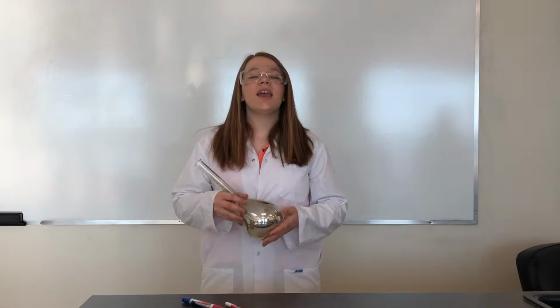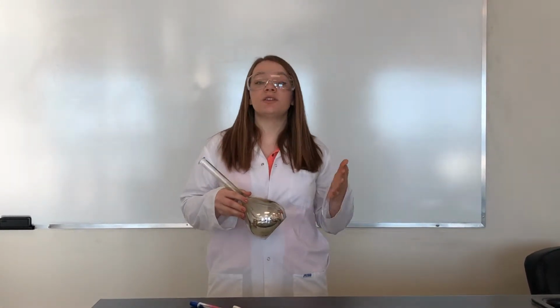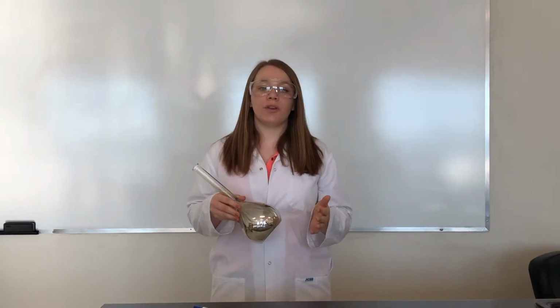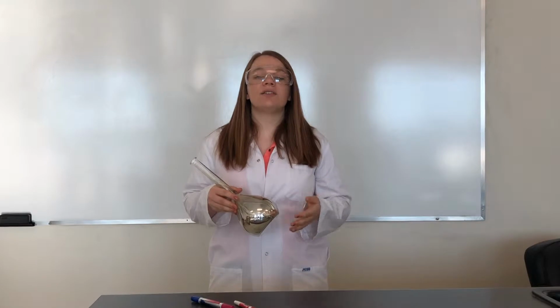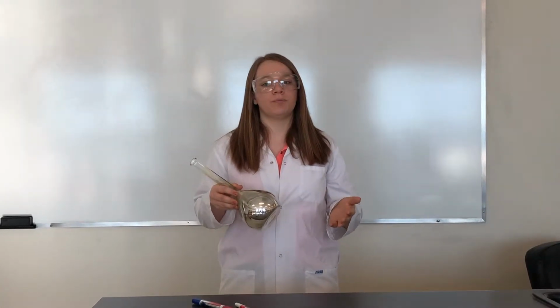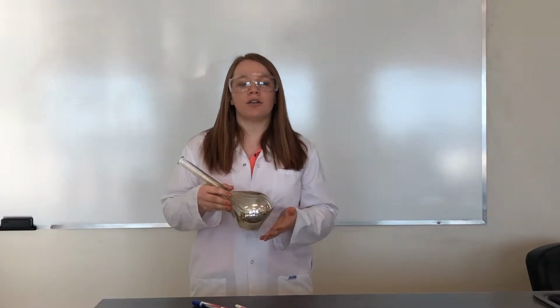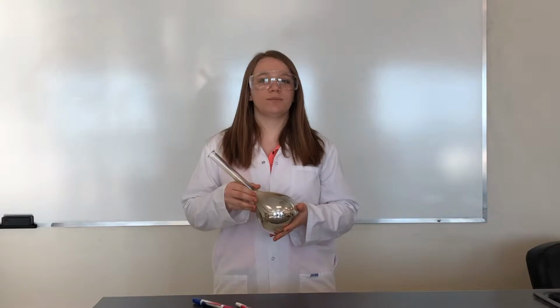In the reaction for making the silver mirror, the silver ions that have a +1 charge react with ammonia, and glucose is used as a reducing agent. This allows the silver to gain an electron within a basic medium to become neutral. These regular silver particles are then able to coat the sides of the container and form a silver mirror.